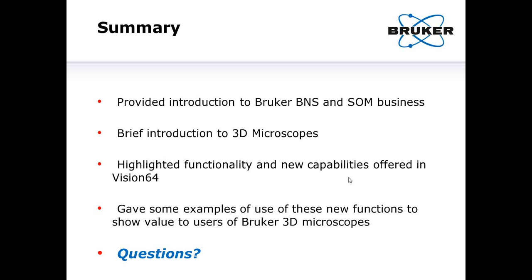So a next question is, how long does it typically take? What is the typical time to get data like you showed for the different types of electronic measurements? The time to getting different data depends a little bit on how accurately you want to have the data and what is of most importance to you. If you want to have the very best accuracy, I recommend using our VXI measurement mode and doing that in an automated way, which will give you the best resolution.